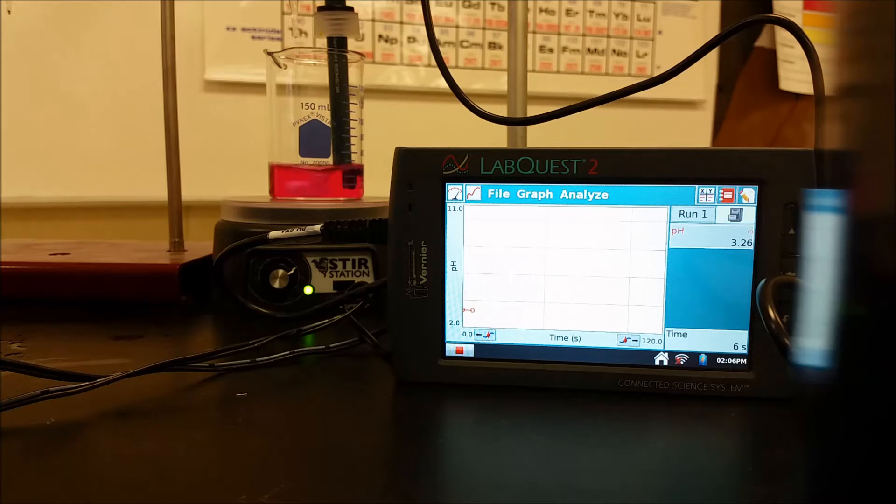Right now we're starting at the very beginning with just the weak acid, and now the sodium hydroxide is being added, and so you'll see that pH starting to rise. As the acetic acid is converted into the acetate, you're going to get into kind of a buffering region now, so the pH is not going to change a ton.